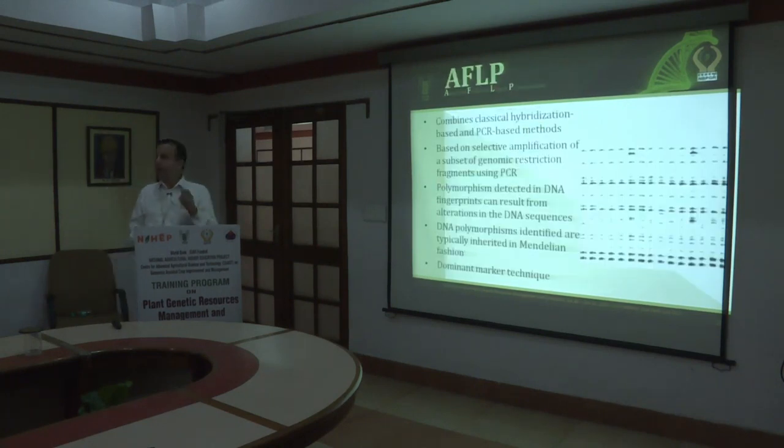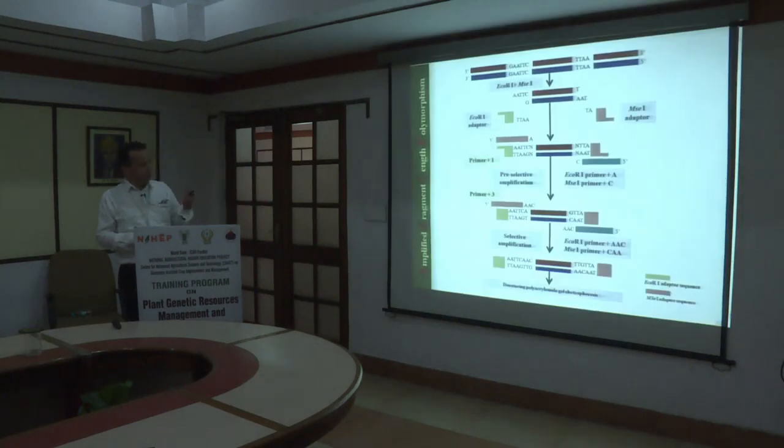Another technique, AFLP, amplified fragment length polymorphism. It is a combination of your restriction-based and PCR. Both methodologies are used here. And this is how a typical AFLP gel looks like.